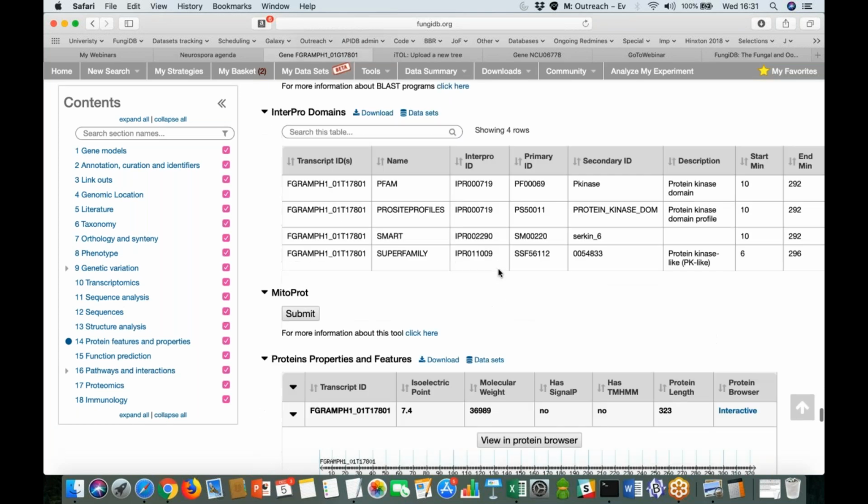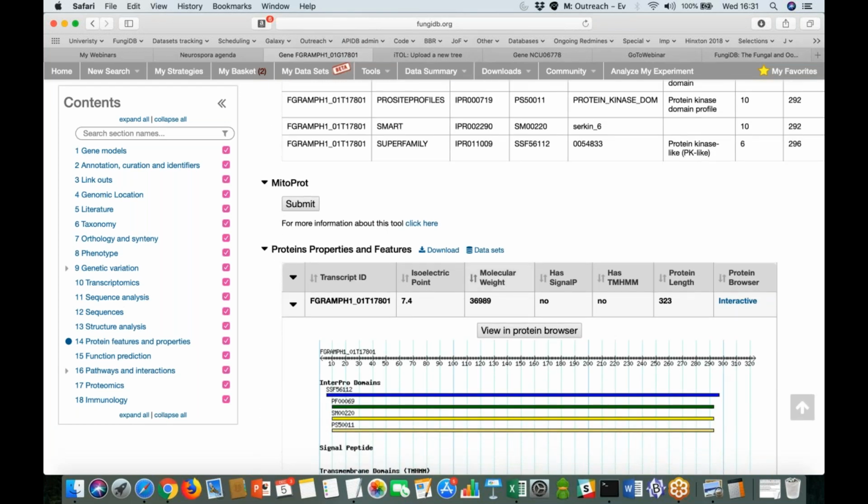Another useful tool is to look at the proteins, for example, that I just mentioned that localize to mitochondria. So the MitoProt tool, it's MitoProt2 software that predicts mitochondrial-related proteins by calculating the N-terminal protein region that can support the mitochondrial targeting sequence, or MTS, and the cleavage site.